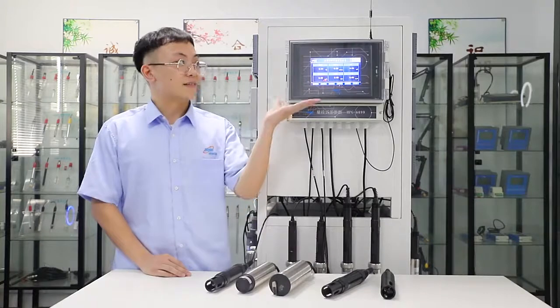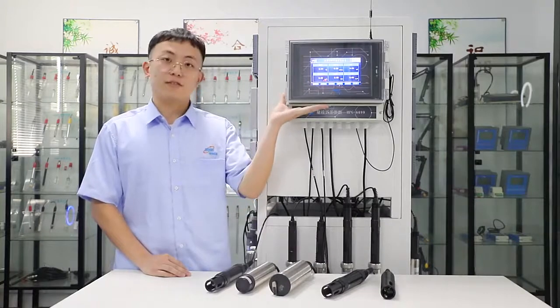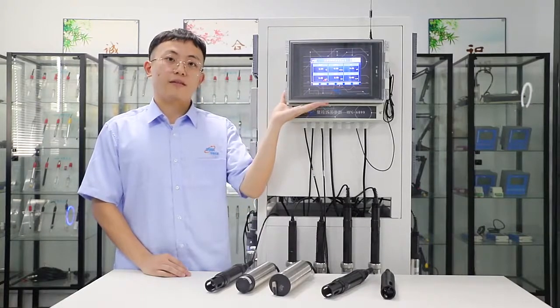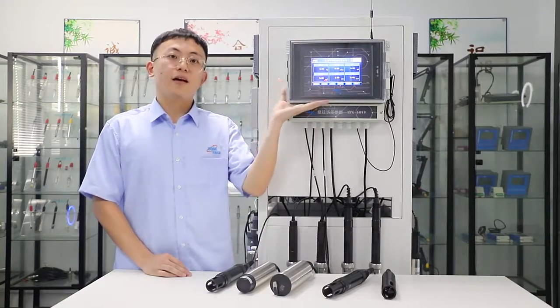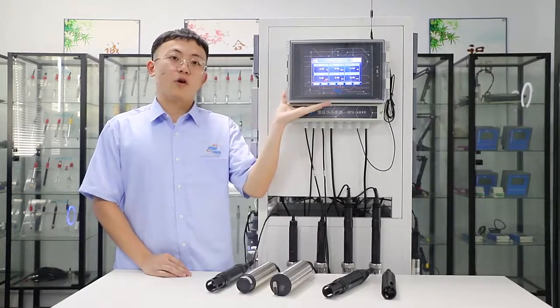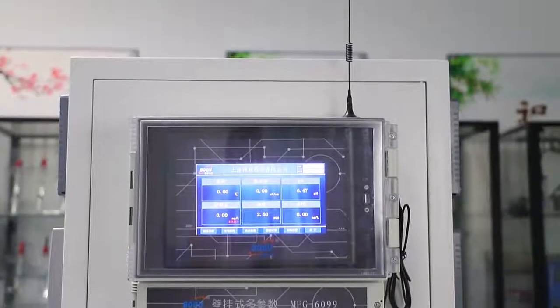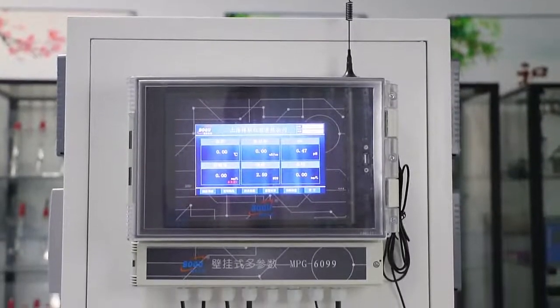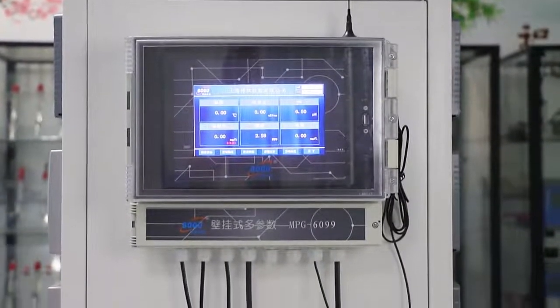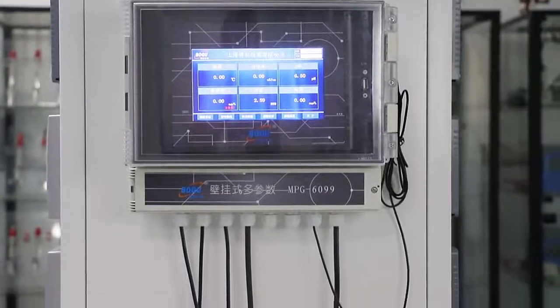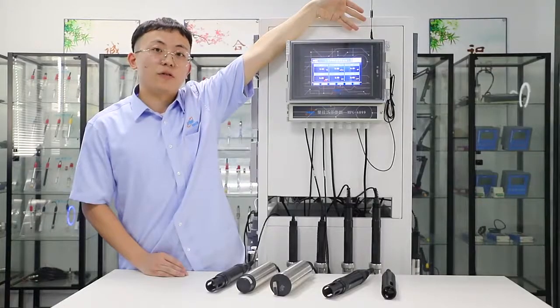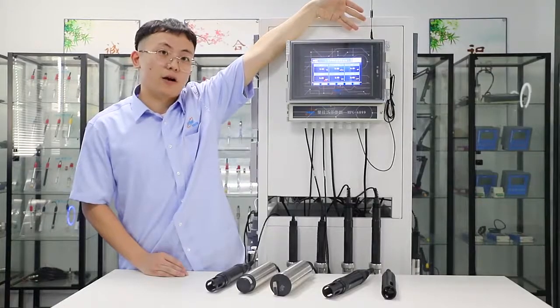It has a 7-inch touch screen and data recording function with USB for you to download the data. The wireless function can connect to the phone app and cloud.